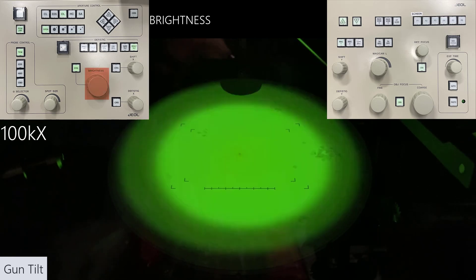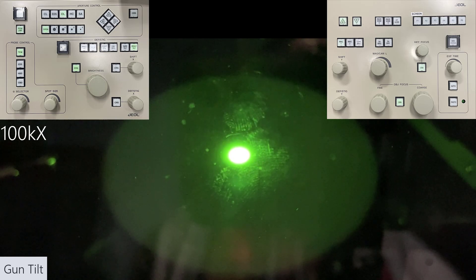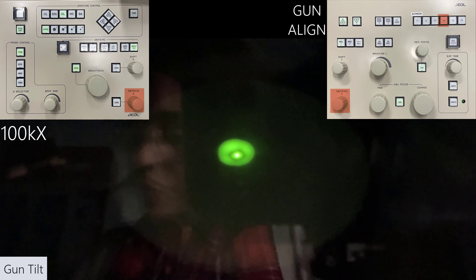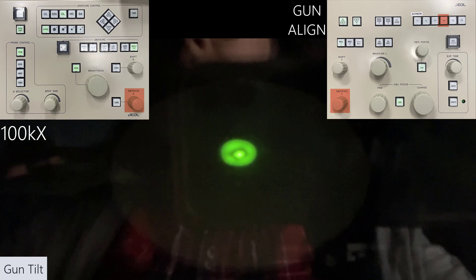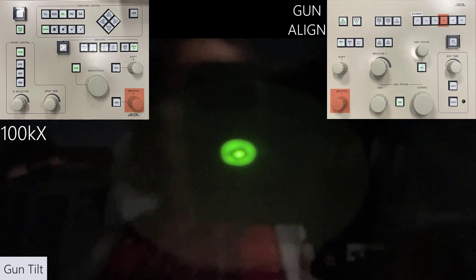Next is the gun tilt alignment. Use the brightness knob to condense your beam, then select the filament image as we did previously for condenser lens astigmatism. Select the gun align button and use the deflector stigmator X and Y knobs one at a time to get the intensity in the four quadrants of the filament image to be approximately equal. Once finished, deselect the gun align button and bring the filament back up to its normal condition using the normal button.